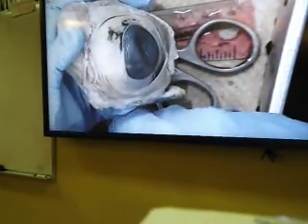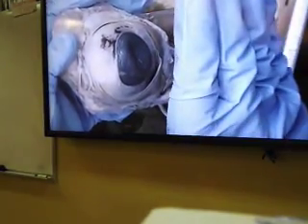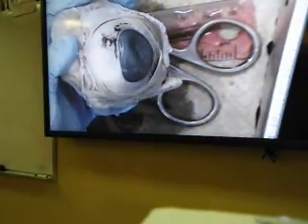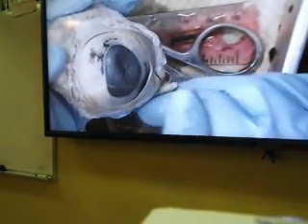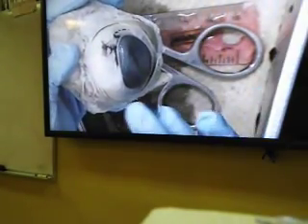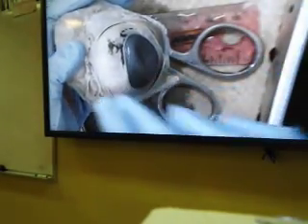So the way we cut the eyeball is so that we can understand what structures are present in the anterior cavity of the eyeball and what structures are present in the posterior cavity of the eyeball. We will be cutting in such a way that it gives us an anterior cavity and a posterior cavity, so that posterior cavity structures are not mixed with anterior cavity structures.